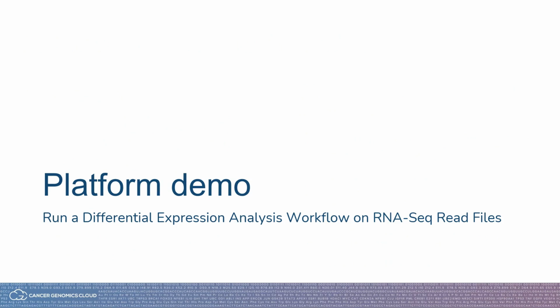I'm going to demonstrate running a differential expression analysis workflow starting from FASTQ files and ending with a list of differentially expressed transcripts. Let's get started.